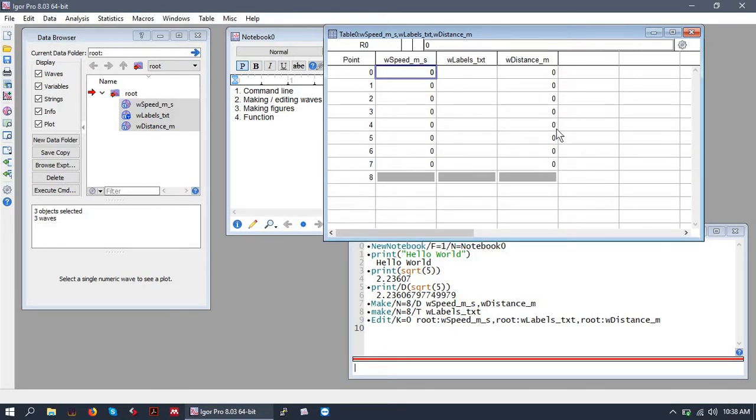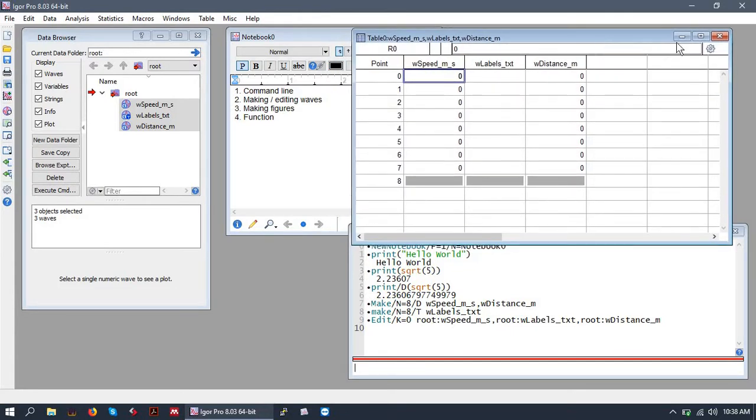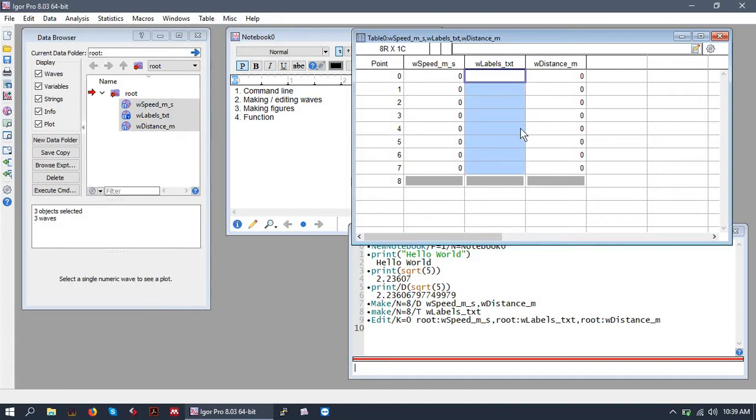And you can see we've opened up a table which is vaguely reminiscent of an Excel window or something like that. It's a bit different than Excel but it's not that complicated. So we have our waves and they're all initialized with the value of zero except for our text wave which is initialized with a blank string.